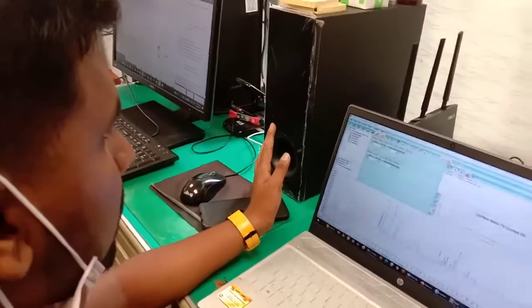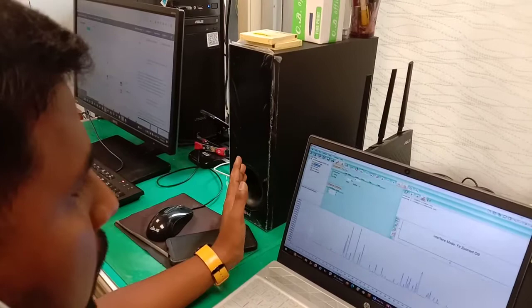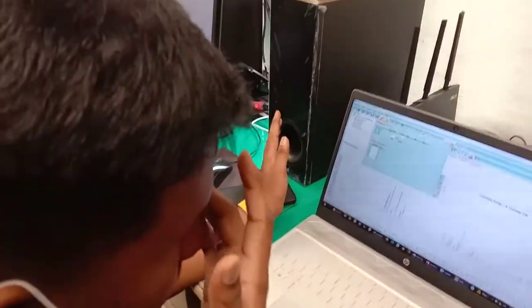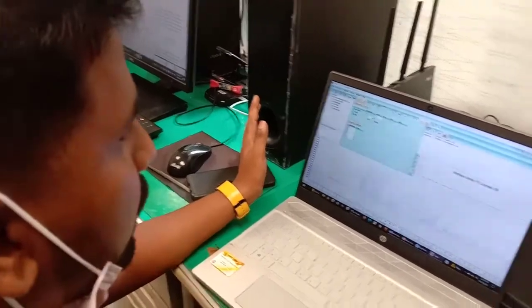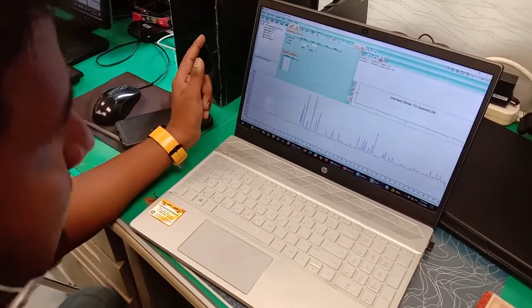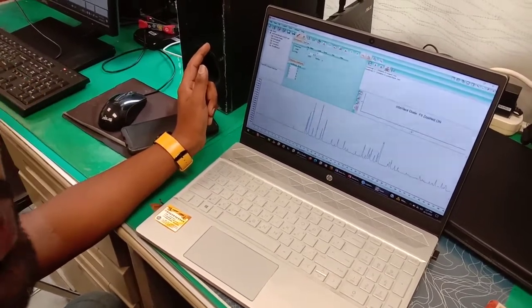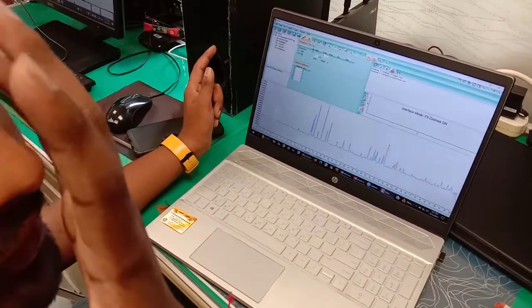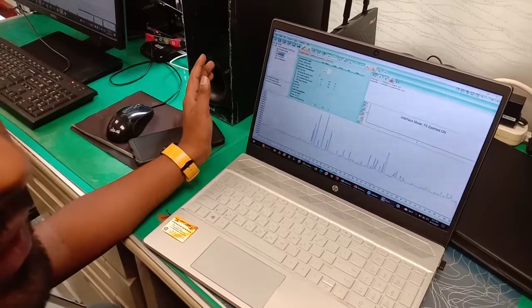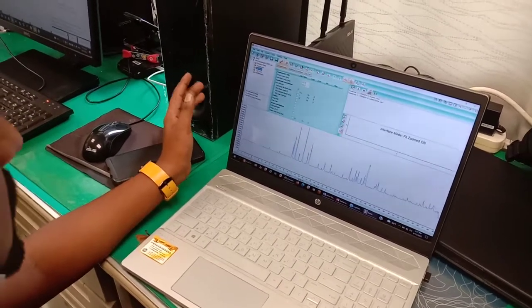Okay, then you have to choose the background, how many background terms you want. The fewer the background terms, the better the refinement. If you go for a higher background, the refinement is more complex. And sometimes if your background is not flat, then you have to use this function 1/x, which is like a polynomial function used to fit it. Then you have to say the instrument, you don't need to do anything. In very rare cases we have to use this one, but it's not our case.